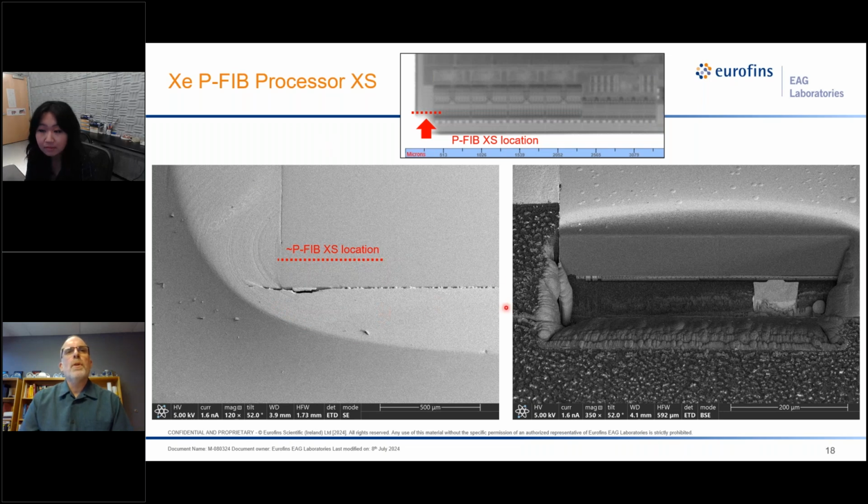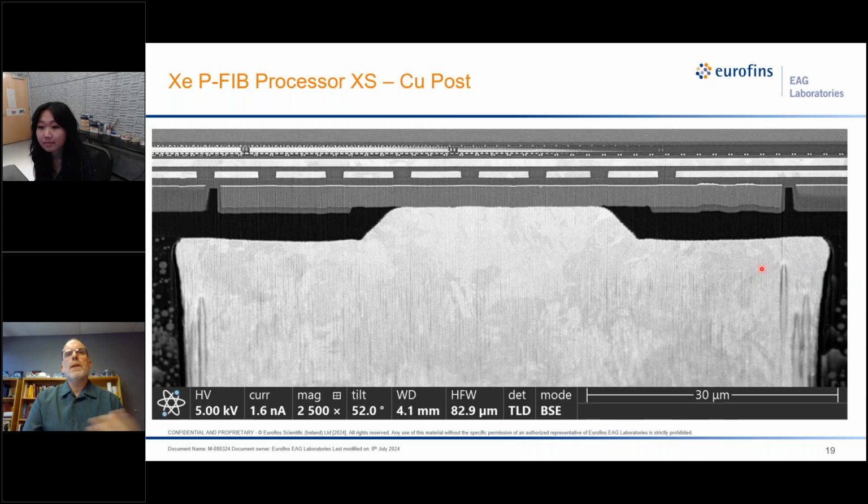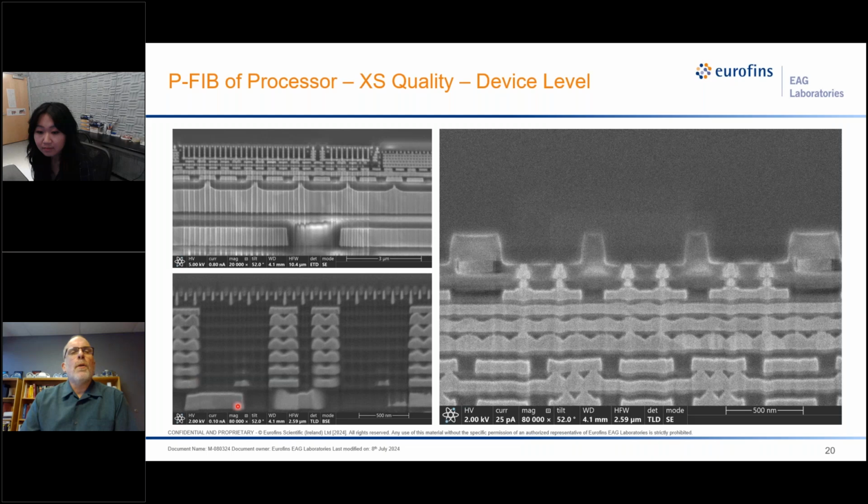This is where we've planarized it with a CNC machine first. And then this is an example of the cross-section we made here, approximately 500 microns wide by 150 microns deep or so. We were getting into the first bit of interconnect and the connections between the PCB board below with a copper pillar up to the chip itself. And we can actually see in the cross section, we have very good continuity between this copper pillar and the device.